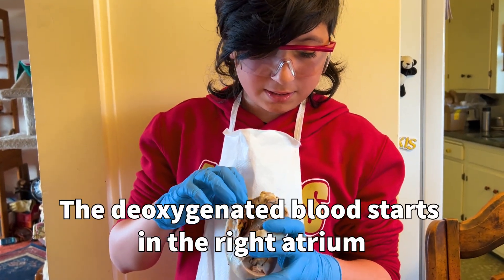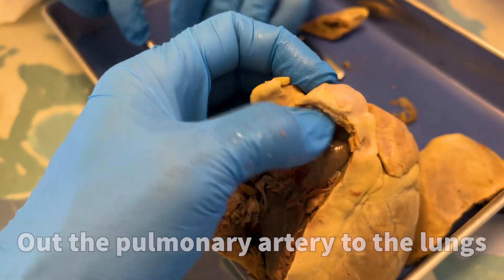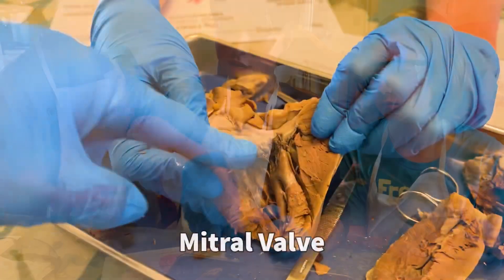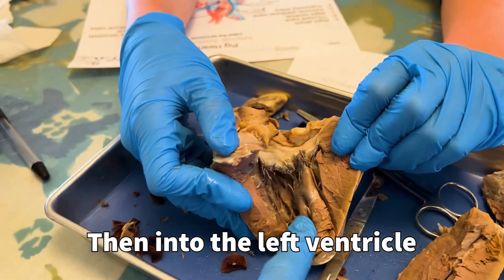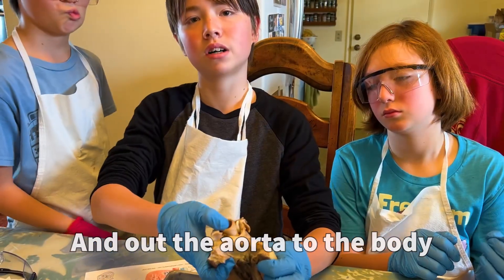The deoxygenated blood goes to the right atrium, to the tricuspid valve, to the right ventricle, and out the pulmonary artery. The oxygenated blood starts out in the left atrium, makes its way down to the mitral valve, then into the left ventricle, through the aortic semilunar valve, and finally up to the aorta to supply the rest of the body with blood.